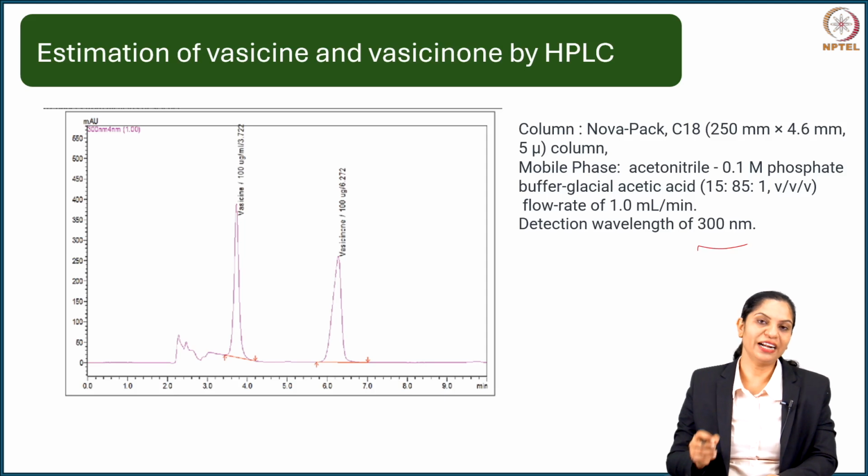So I put the standard concentration. After this I will inject my extract, then I will see how much is the area under the curve for the extract, and on that basis I can quantify this.